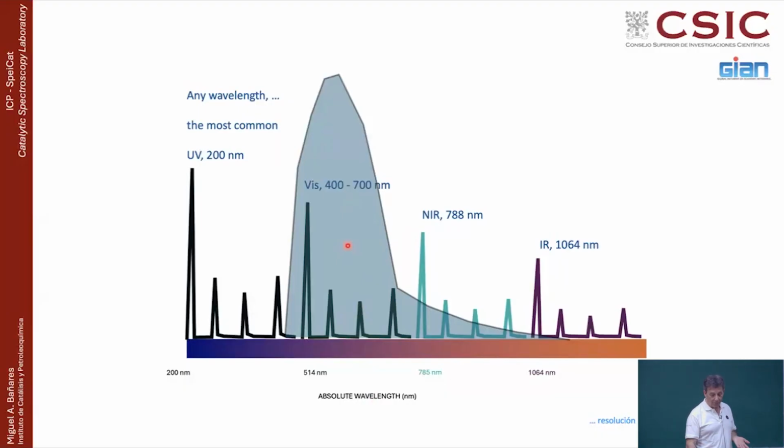So how do you go around fluorescence? Well, if you use infrared laser or near infrared, the fluorescence will be irrelevant or very weak. So you can see your peaks despite the fluorescence.